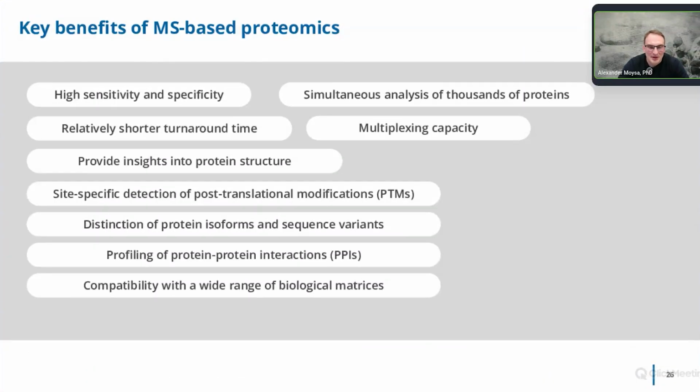And to sum up our presentation, I would like to highlight some benefits of mass spectrometry-based proteomics. The collection of comprehensive information is advantageous in any field of drug discovery or drug development processes, as it facilitates better decision-making, problem-solving, and strategic planning. In addition, high-quality data is crucial for the effective implementation of machine learning algorithms and artificial intelligence in drug discovery and drug development.